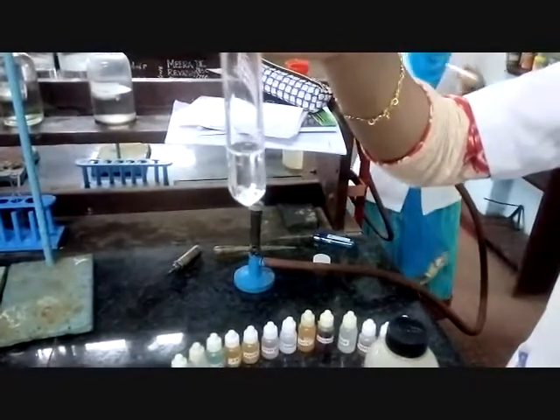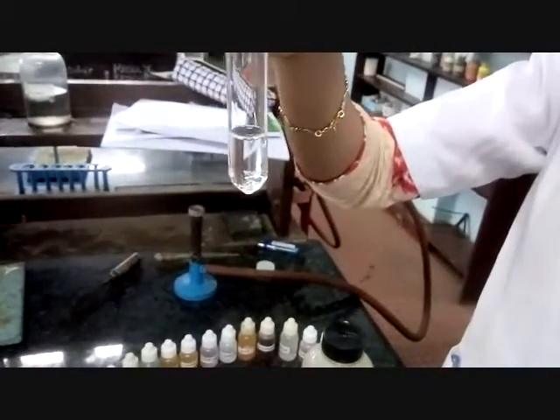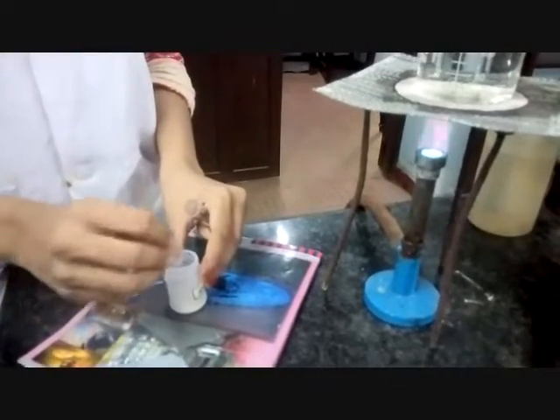It is readily soluble in cold water. The compound may be sugar or urea or may be phenol. In hot water: readily soluble in hot water, may be sugar or urea or may be phenol. The solubility of the substance in dilute HCl.